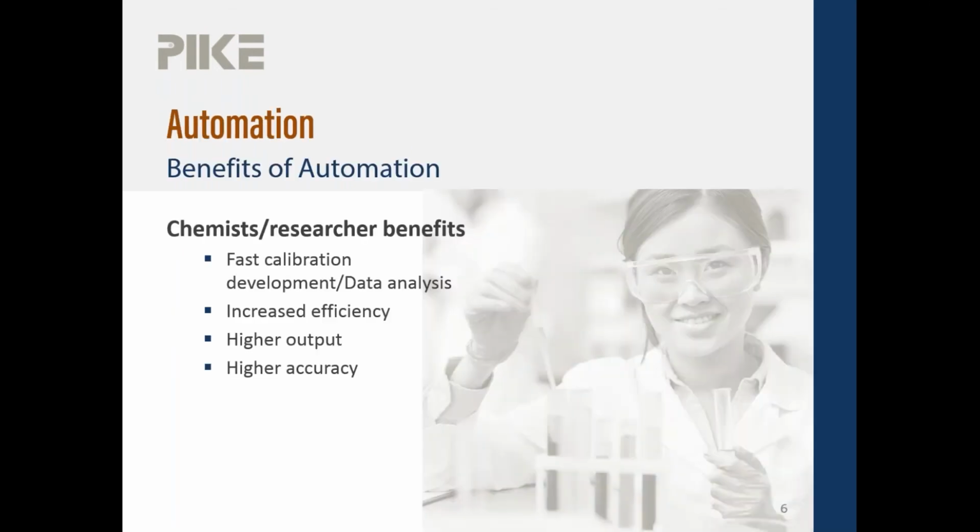So often when you think of automation, you think of equipment or instrumentation that can make you more productive and allow you to increase your efficiency. And sometimes you start to think of benchtop chemists, increasing that workflow. But also through this seminar, I'm going to introduce some applications where researchers could benefit as well. So I've listed a few here.